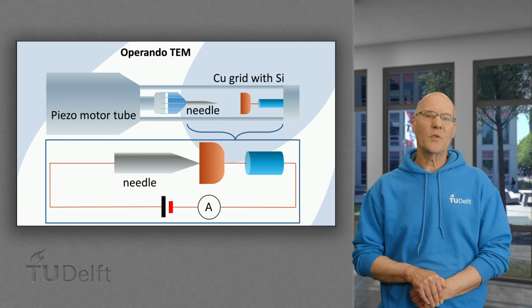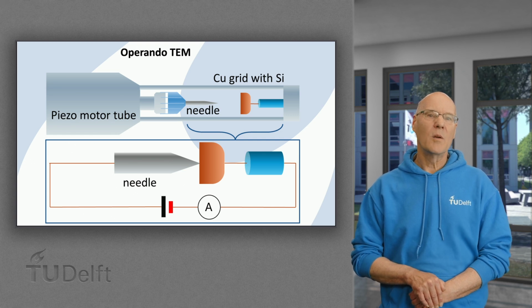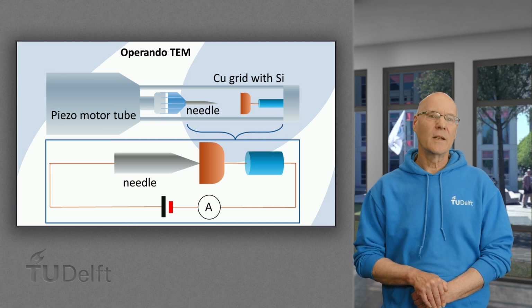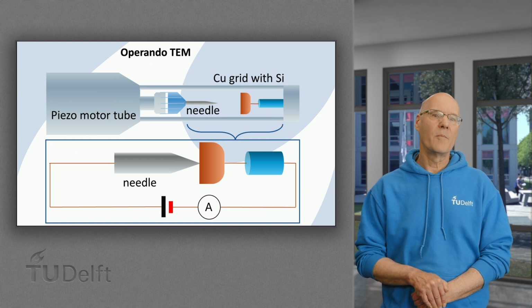To achieve the objectives, an in situ sample holder is utilized to create a nanoscale battery, where the piezo motor moves the solid electrolyte to the silicon nanoparticles, thus creating contact. And silicon is lithiated by applying a negative bias and positive to delithiate it.